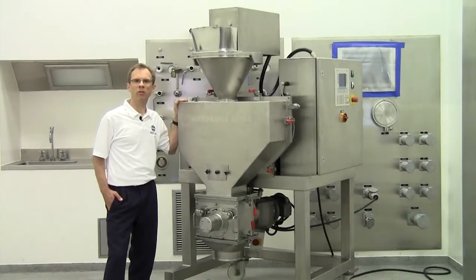Hi, my name is Leroy Heinrichsmeier and I'm specialized in compaction technology for Hosokawa Micron Powder Systems, based in Summit, New Jersey. In the next few minutes I will give you a quick introduction to the Hosokawa Alpine Pharma Pactor.